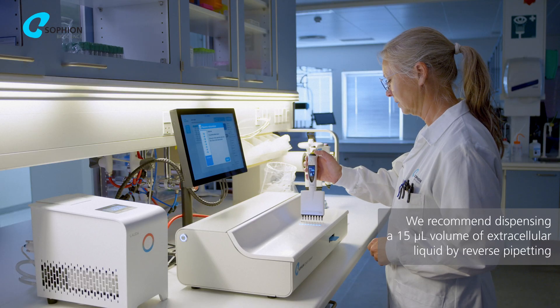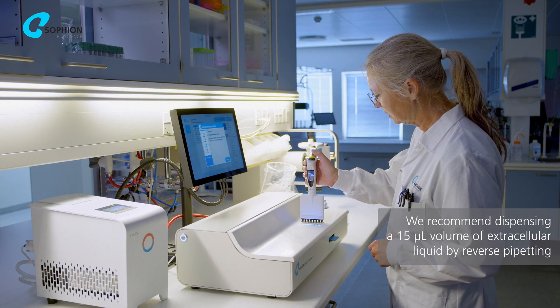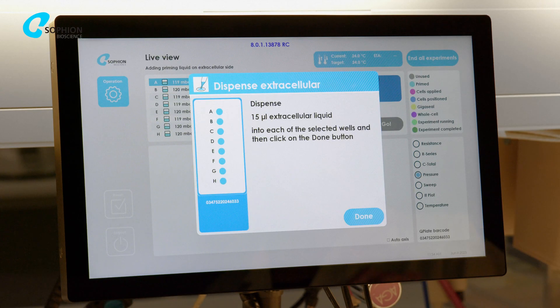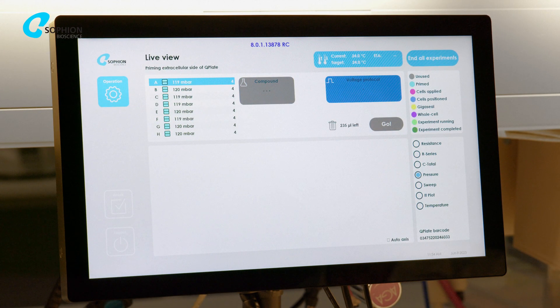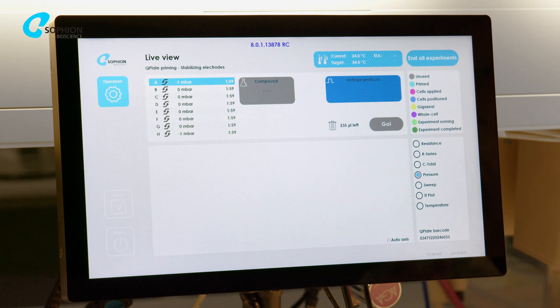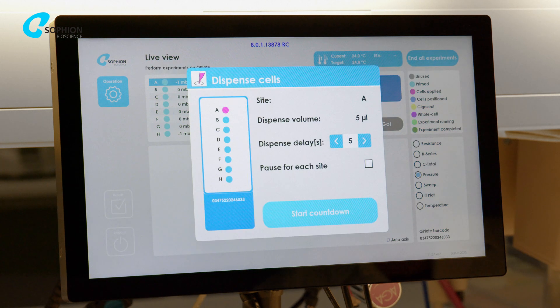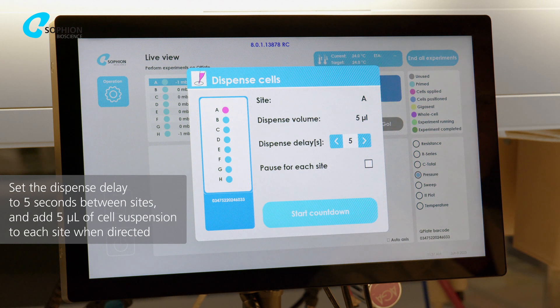Add extracellular liquid to the recording sites by reverse pipetting. Press the Done button. The Qpatch Compact proceeds to prime the recording sites. The countdown will indicate the completion of this process. Choose the speed at which you wish to move from one recording site to the next by specifying the dispense delay.